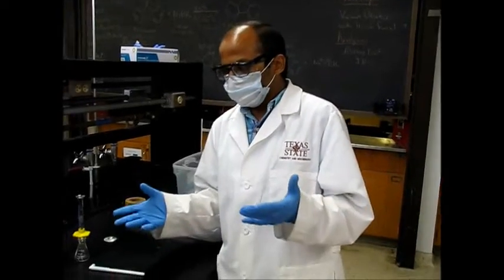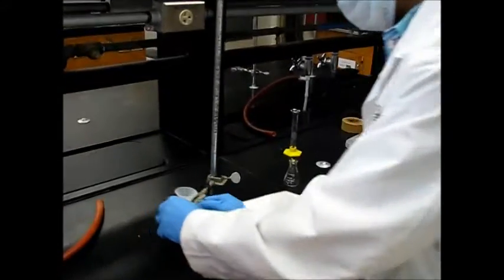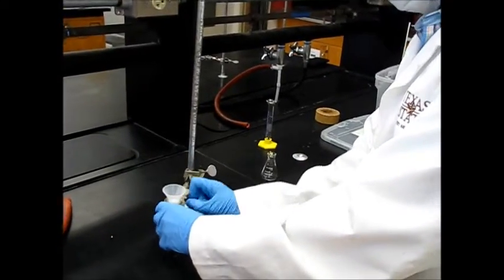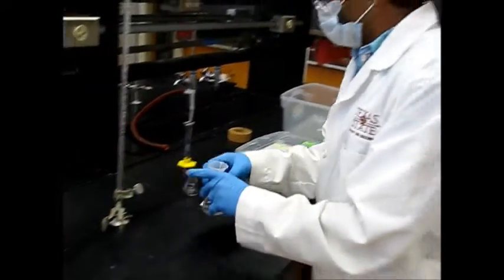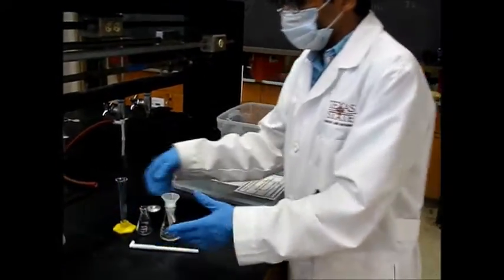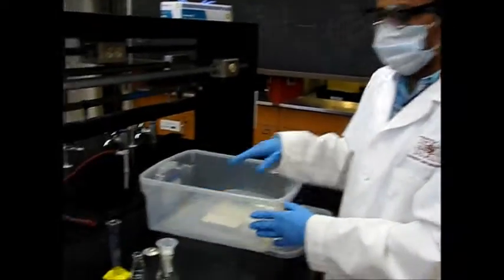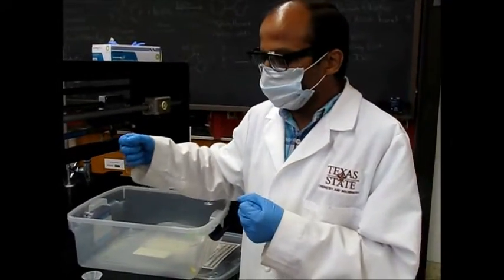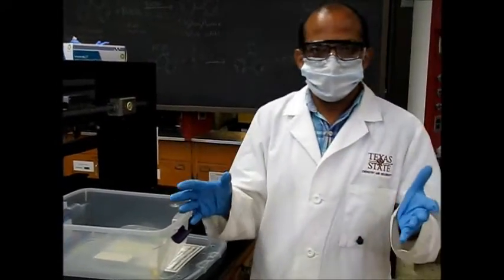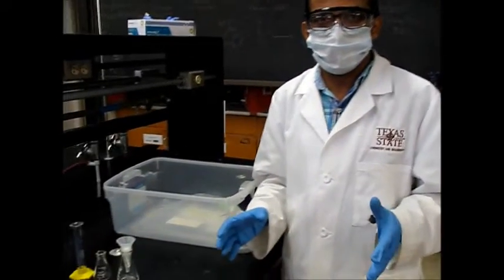So while our compound is drying, now it's time to remove all the dirty glassware, and this is another fun part of this lab, to clean all these glassware nicely and dry it, and then return it to the stock room so that it will be available for the next student. And while you are in the lab, don't remove all your PPE. Please wear it all the time.